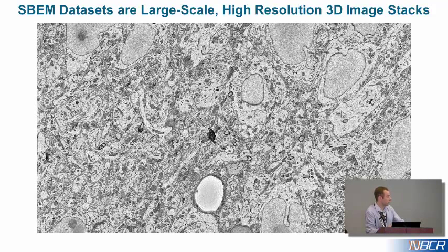Nucleoli inside of the nucleus. And this is only shown in one cell for clarity, but you can imagine each of those cells filled in with all of that data. And all those are quantifiable mesh structures. We can get volume, we can get surface area, we can get number, we can analyze clustering, branching patterns. All of those things can be quantified from these data once we have those meshes available to us.